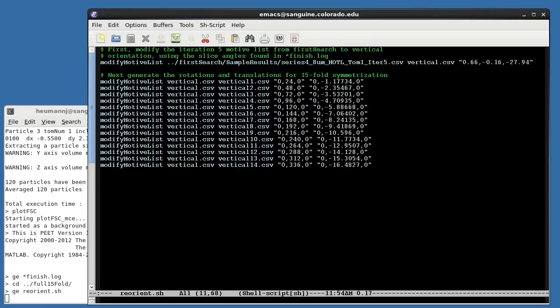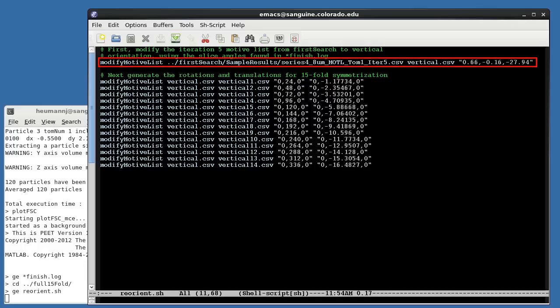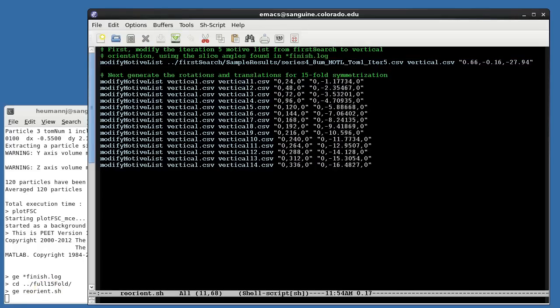As before, we'll use program modifyMotiveList to generate the new initial motive lists. First, we apply the slicer angles just noted to the final motive list created by the previous alignment. This creates an output motive list, vertical.csv, in which each particle will be rotated to have the local microtubule axis along the tomogram y-axis.